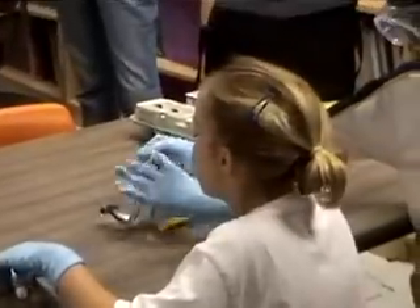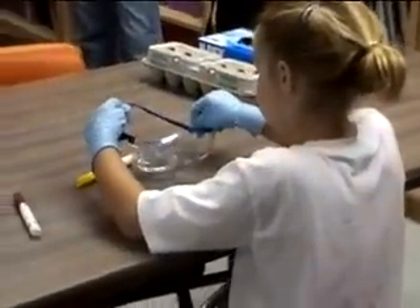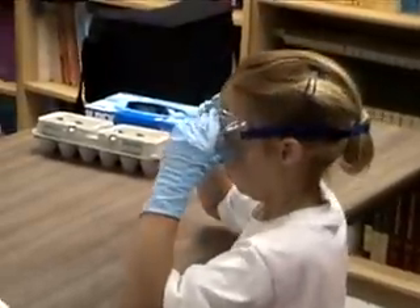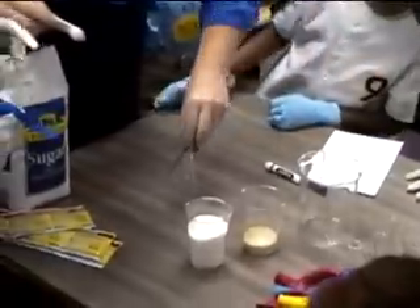It's important that each student wear appropriate safety equipment. Goggles must stay on during the entire experiment. Other students might splash chemicals or small things like iron filings, and if students are not wearing their goggles, their sight can be damaged.